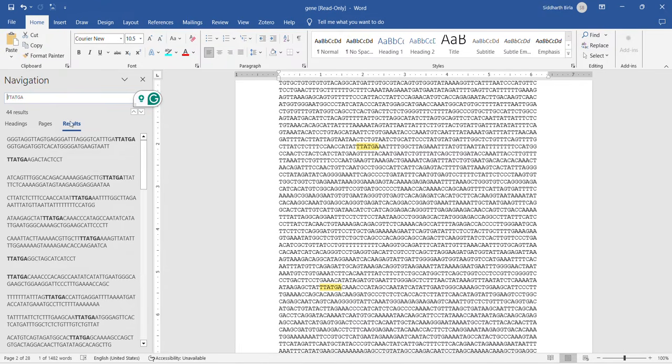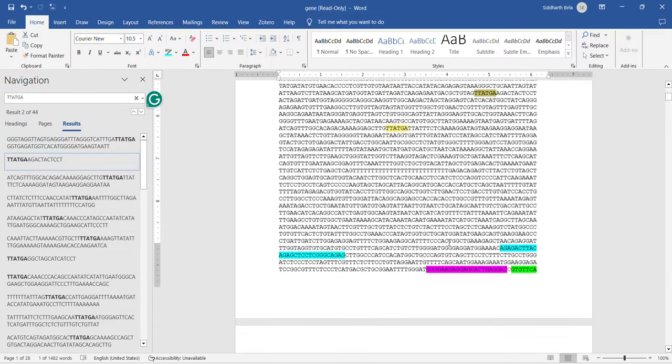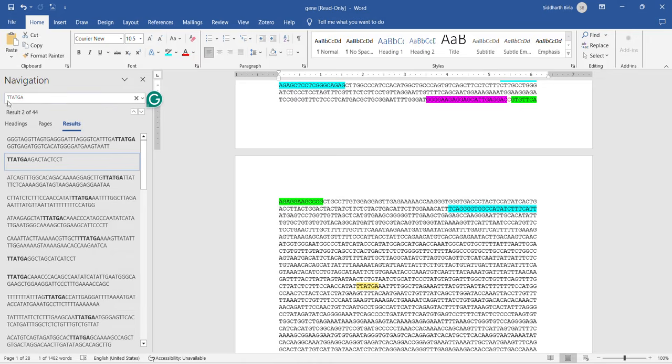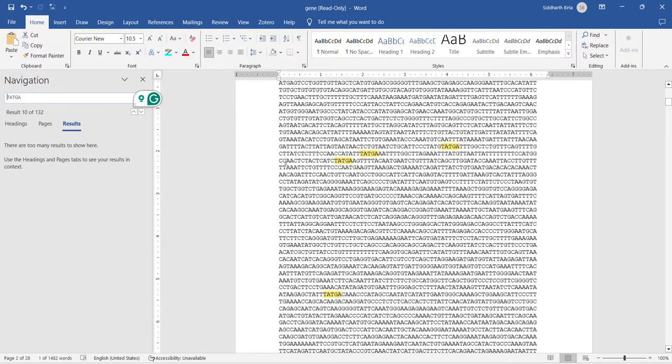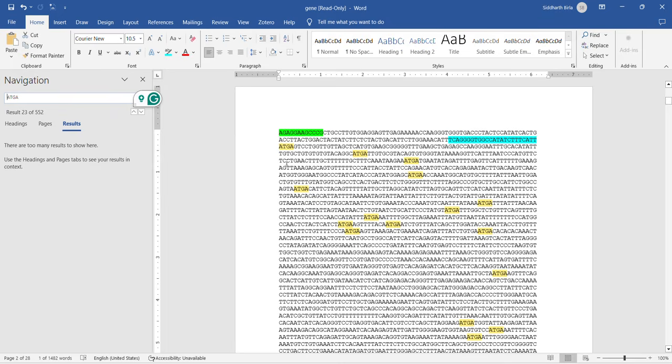Since it starts showing too many regions where it is aligning, you just need to check which is yours, or if you can remember, you can check it that way also. Right? It is here. So these four that I deleted, I'll highlight these also, right?